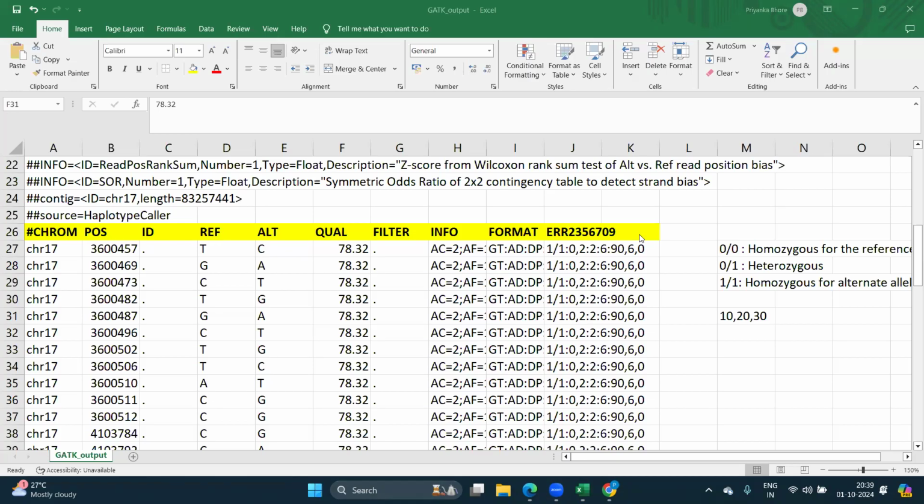That means you don't have the annotation for this particular variation in this VCF file right now. So how can you get extra information about your variation? Maybe some people have already studied it, so for this particular variation the information may be present previously. Sometimes the variations are novel, and for them you will not have any extra information. So you can go for further studies about those novel variations accordingly.